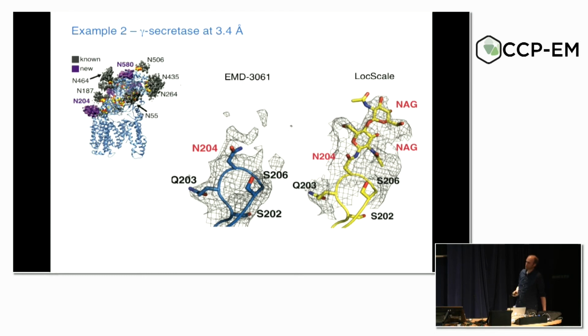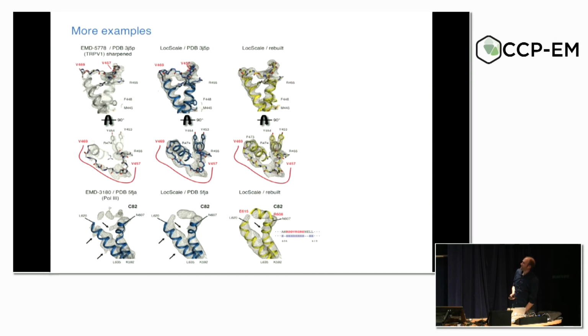And if you do theoretical predictions for glycosylation sites, then at all these additional sites you actually have predicted glycosylation patterns as well. We certainly are not able to confirm the conformation of the glycan in this density, but you do see additional density that is suggestive of glycosylation.